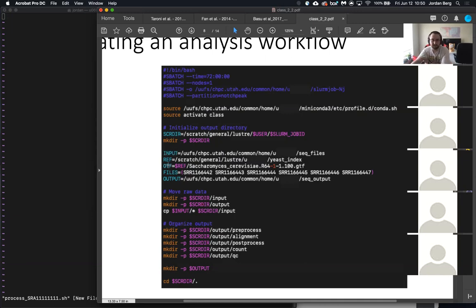I'm going to make a variable for the GTF file. So using that reference variable with the GTF file name, I will have the list of files that I'm going to be using. And so here, I'm not going to specify the .fastq because I'm going to want to reuse just the file IDs, the file names, and be able to swap out the file suffix as I go through the different steps of going from a FASTQ file to a BAM file to a tab separated file.